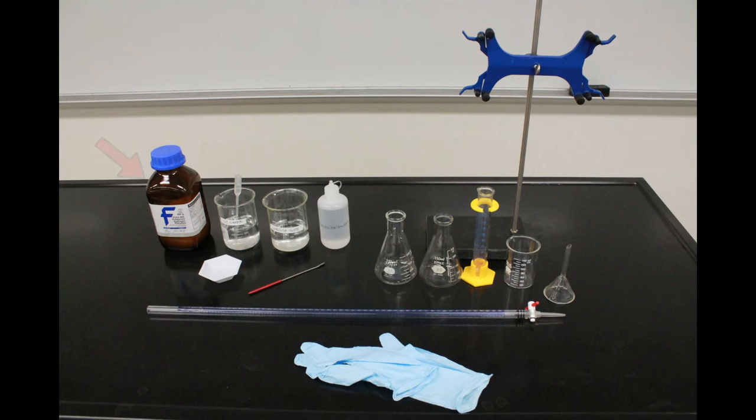Here's what you're going to need. A bottle of KHP, a weigh boat for the KHP powder, a spatula, some deionized water, make sure not to use tap water, your unknown concentration of NaOH, phenolphthalein. I think you're already familiar with this indicator by now.